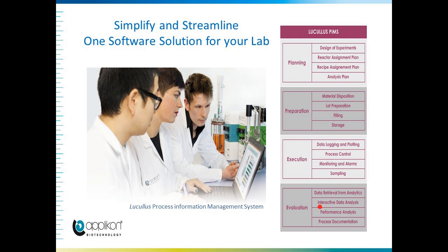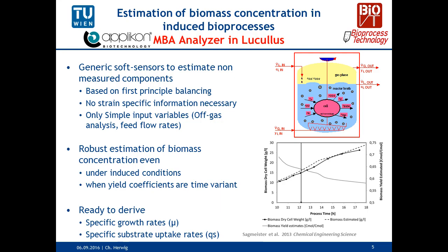And this includes also what I mainly present today: data analysis, performance analysis. And of course, these elements can not only be done in a historical way, but of course also be fed back to process control and run in real time. So in fact, we are linking today in this webinar these two issues mainly.